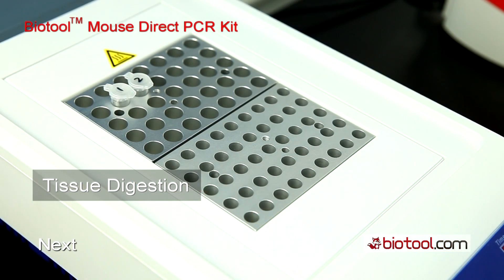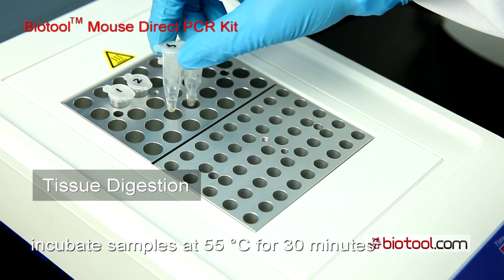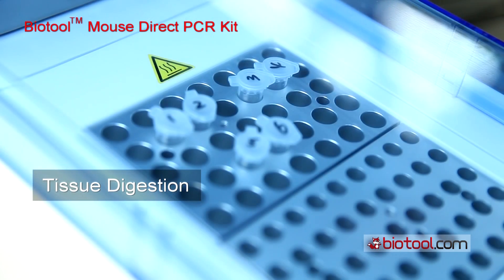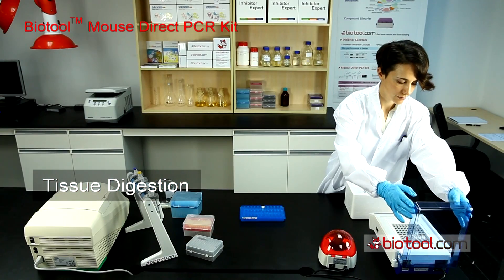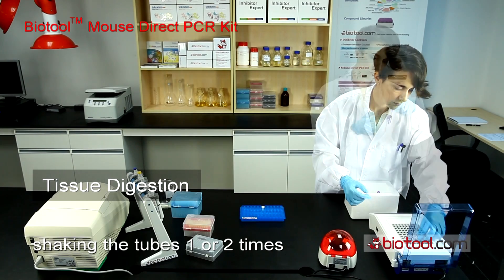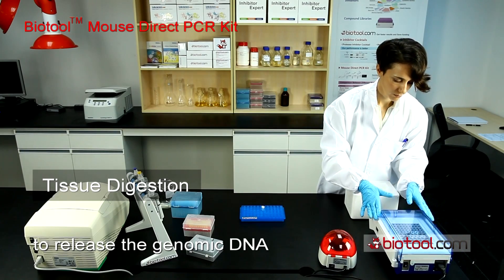Next, incubate samples at 55 degrees Celsius for 30 minutes. During this tissue digestion step, shaking the tubes one or two times will be helpful to release the genomic DNA.